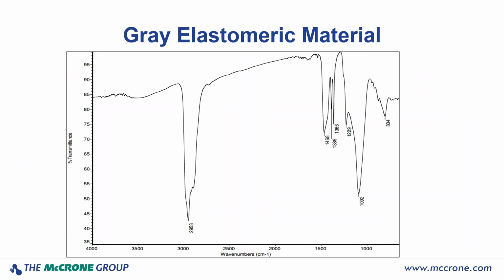So now that we know what our clear coating is, let's consider our elastomeric core material. Once again, a quick visual assessment shows that this is a good quality spectrum. We have a little scatter, which is evident from that lowered baseline at the higher frequencies.